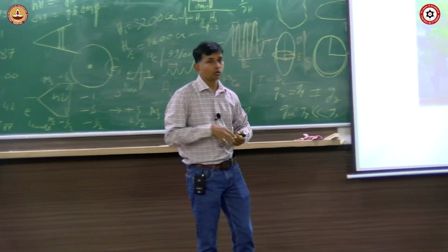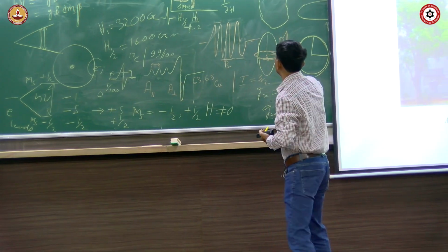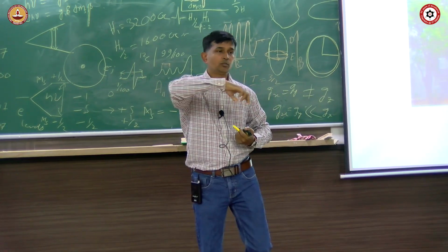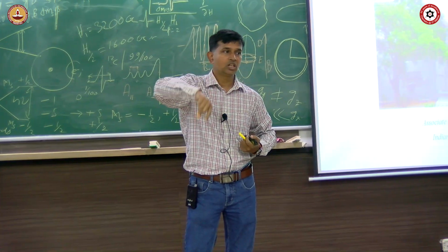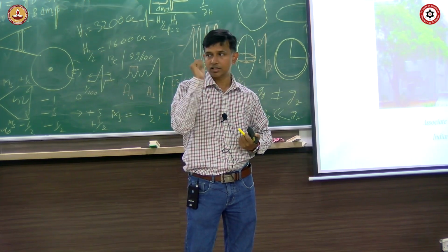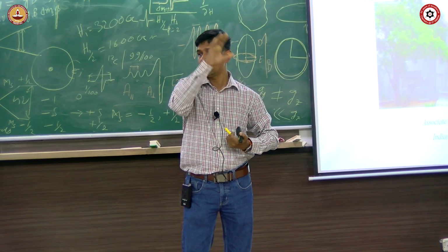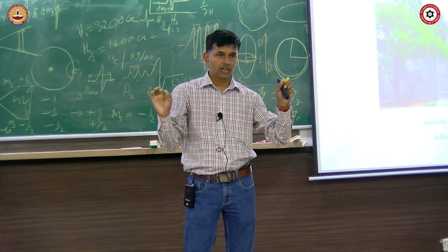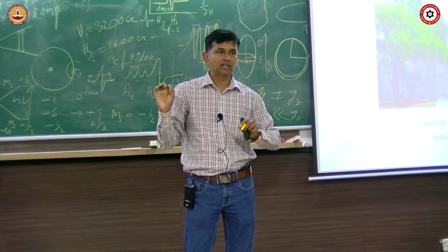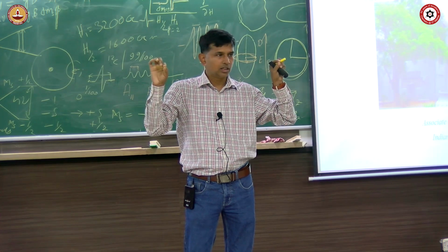So now if I draw a benzene ring, there also I will get a signal for the proton. For benzene you have 6 protons, so I get 6 plus 1, 7 signals, 2nI plus 1. For one hydrogen the spin is half, so I will get the 7 lines due to all 6 hydrogens. I am also supposed to get satellites for the 6 carbons, and these satellites may come in the noise or can come with good intensity.